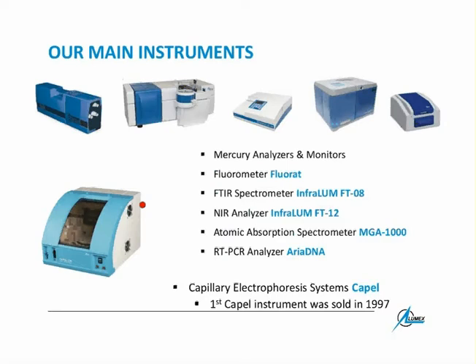You inject your complex solution into the capillary, then you apply high voltage, and your components start moving along the capillary with different velocities. And of course, in order to get reproducible results and rightly identify all the peaks, the reproducibility of migration times must be on the highest level possible.